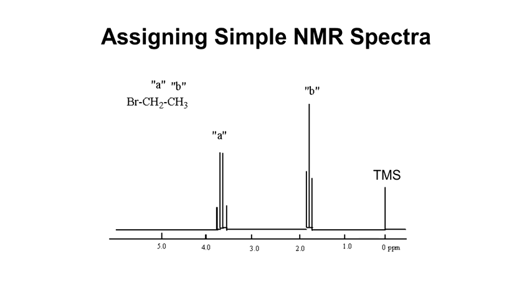And because of the presence of 3 hydrogens or 2 hydrogens, we'll get different coupling patterns. So the 3 hydrogens on B produce 3 + 1 peaks. The 2 hydrogens on A produce 2 + 1 peaks for B. So this is the coupling, and it allows you to figure out which atoms are which and to determine what the structure is. So that's an NMR spectrum of a pure compound, and this is what we do in chemistry to figure out the structure of pure compounds.